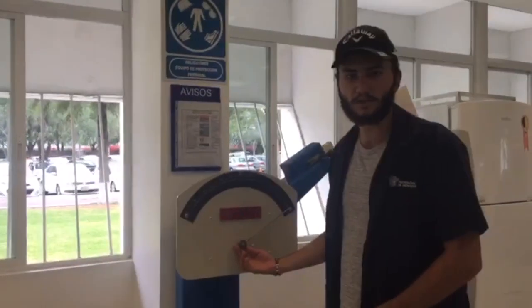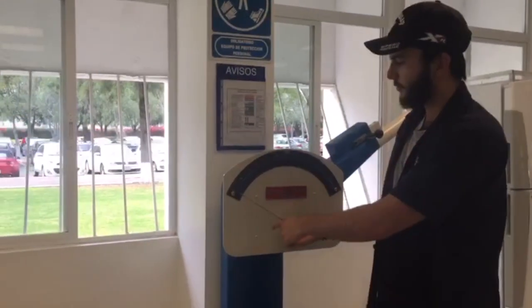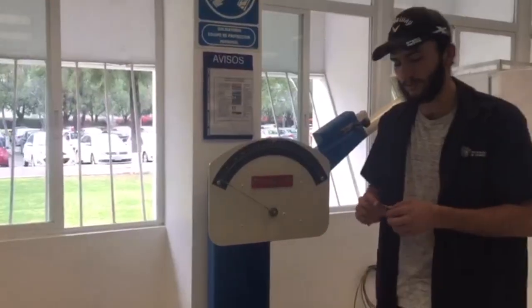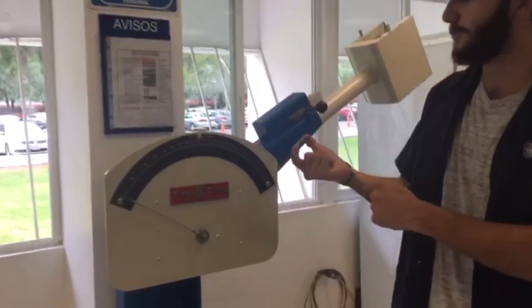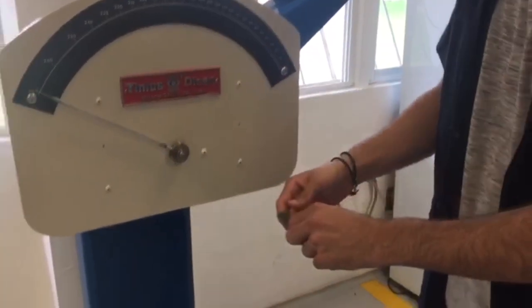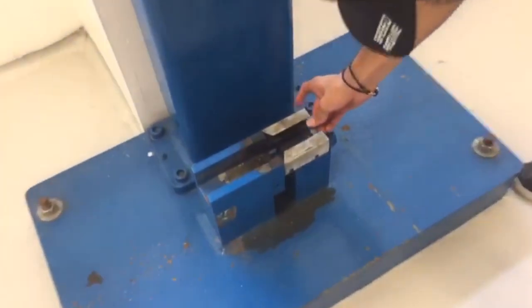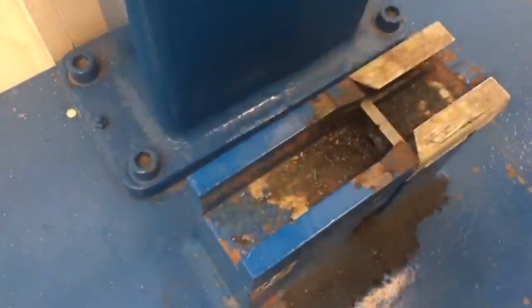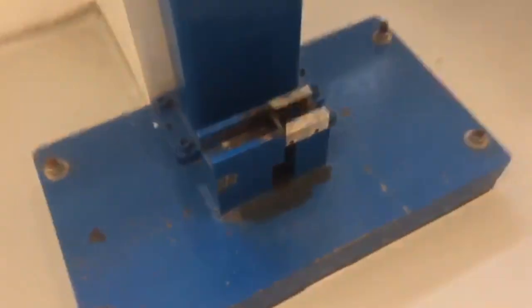Then we are going to use the actual sample. We need to put the gauge at the end, and remember that the sample needs to be placed with the mark facing the opposite side of the impact. So we need to put it like this, with the mark facing outwards.